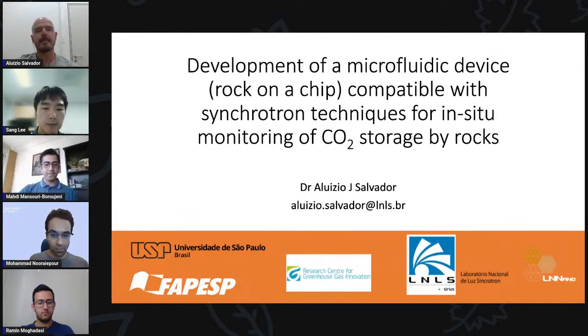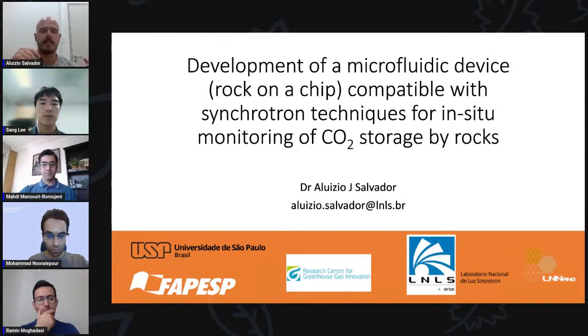So the first question, I didn't give much detail during the presentation because it's something that we are still working on. We got some results, but it works for one sample and does not work for the other. Basically we used a drill, a mechanical process using just water to refrigerate the rock. We could do it in some samples, but other samples with bigger porosity or harder rocks, it didn't work, and we need to figure out how we are going to do it yet.